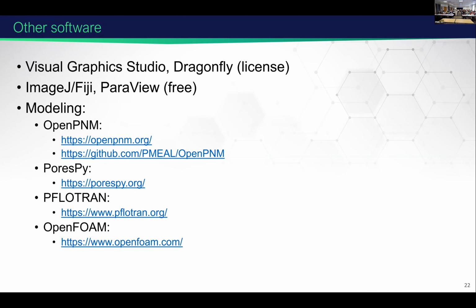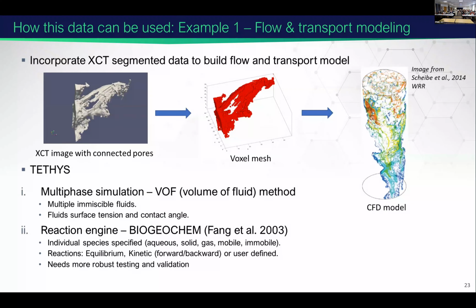And for modeling, I list a few options: OpenPNM, PFLOTRAN, which you will hear about from Maruti soon, and OpenFOAM. I think I have some more information on these as a reference. And so now to some examples.